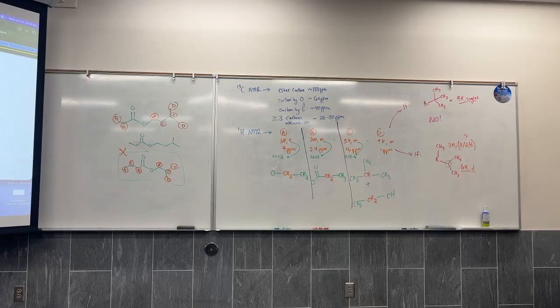I also, to be honest, I didn't see a way to search on here on SDBS for the HSP number. So there might be a way to do it. I don't know how to do it. And to be honest, I wouldn't recommend trying to take the spectra you're given and solve for it without actually going through the work. Can't recommend it. You might kill your time, yeah.